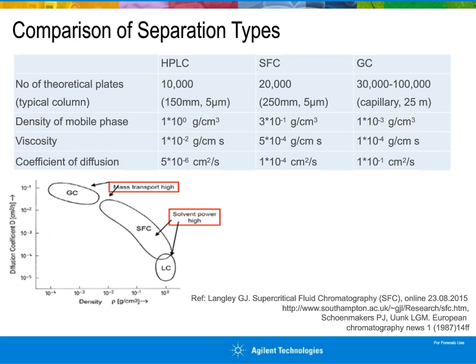If we take this a little bit more into detail and look into the solvent power of SFC and the viscosity that SFC has, then we can add multiple columns together to get up to 200,000 theoretical plates in a chromatography scenario. Together with different columns, you can analyze the very polar compounds. You can compare this with the proper column, almost with a HILIC separation.